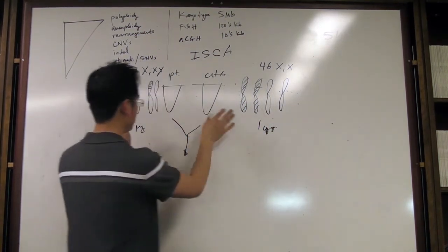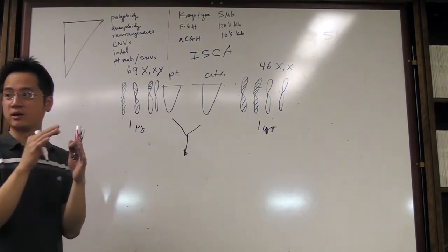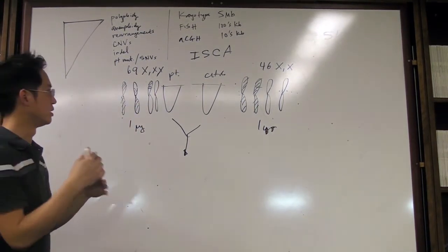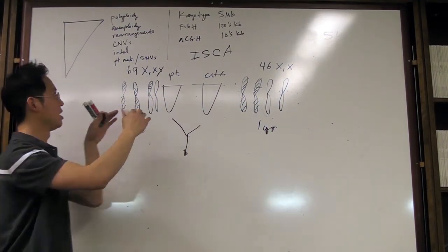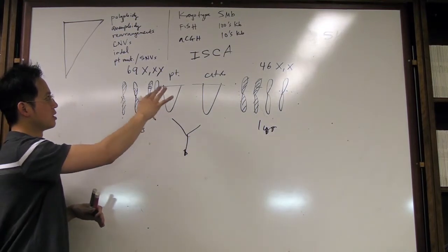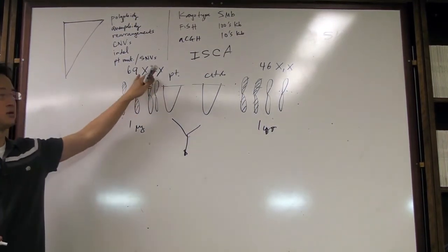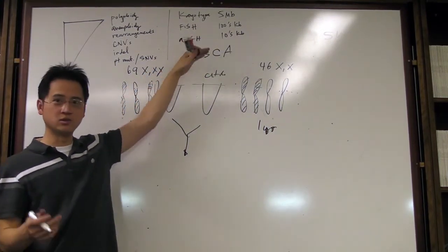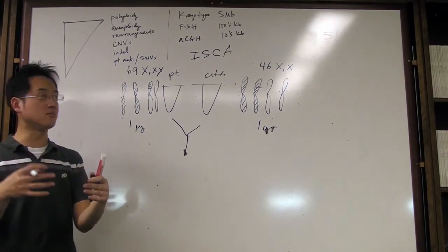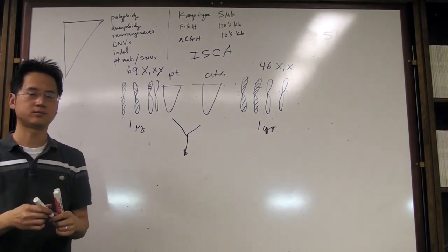Technically, the dosage between these two are different, right? But when you go to do the labeling and everything, and you do the copy number assessment, you basically normalize the two conditions. It's sort of a copy neutral across the genome kind of change, so you will not be able to pick this up. You will by FISH, because you're looking in situ at one cell at a time, and you will by karyotype, because technically it's also an in situ assay.